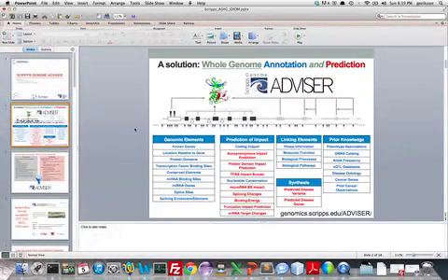SG Advisor is an annotation pipeline. It annotates based on genomic elements, for example, known genes, location relative to gene, protein domain, and prediction impact, coding impact, nucleotide conservation, microRNA impact, linking elements, molecular function, biological pathways, prior knowledge, phenotype association, GWAS catalog, allele frequencies, eQTL databases, and disease ontology, and many other databases.